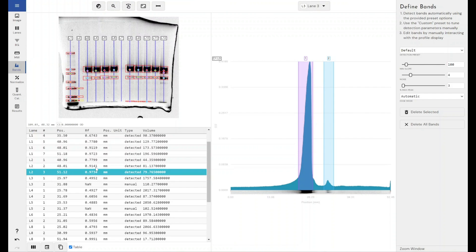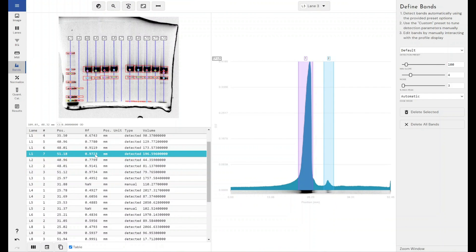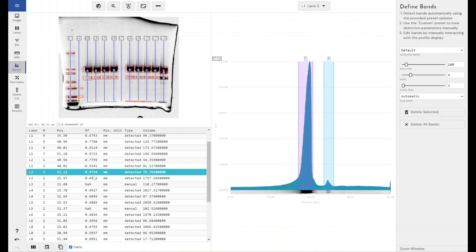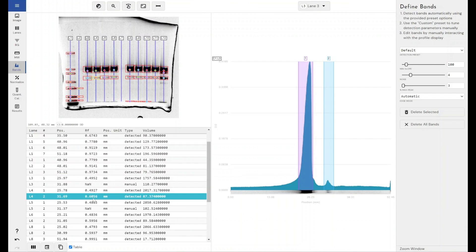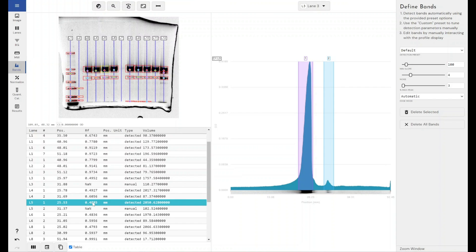And you can use this value to determine the rough sizing of your protein, your DNA, your RNA, whatever it may be that you're looking at on your image. You can see how far it's migrated and how that relates to all of the other samples within your experiment.